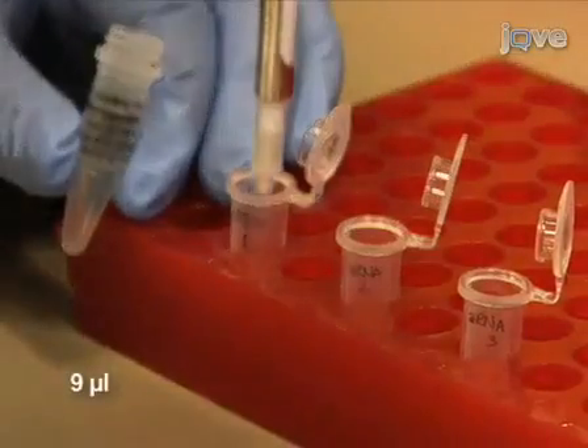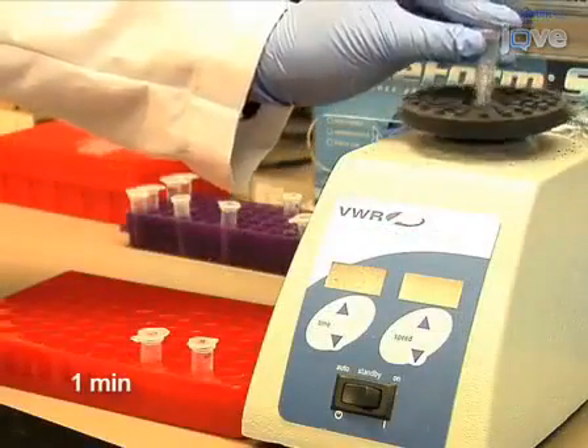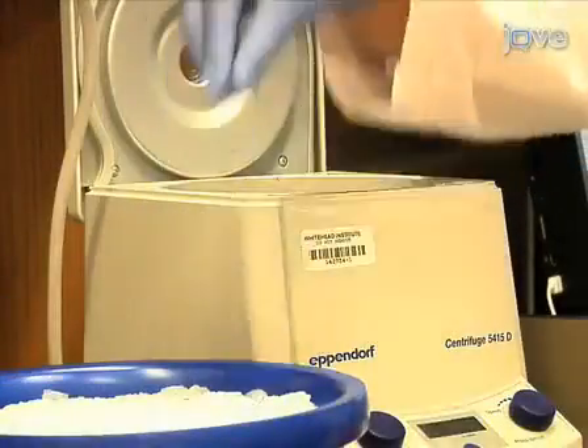After they have dried, add 9 microliters of coupling buffer to each tube and resuspend the aRNA by gently vortexing for 1 minute. Centrifuge briefly to collect the sample on the bottom of the tube and then let the sample sit on ice.